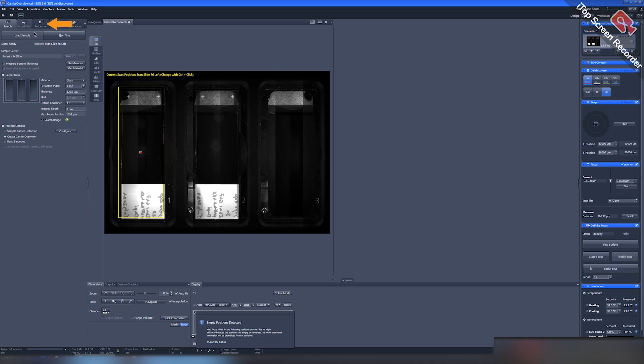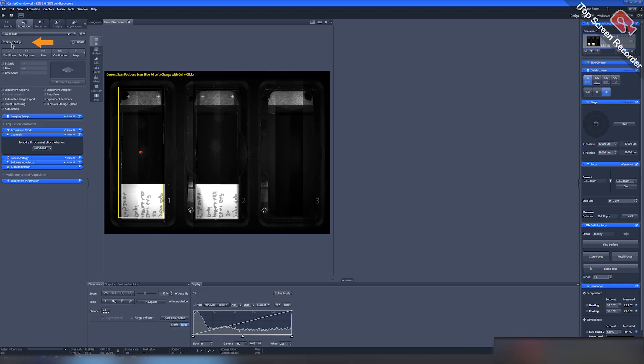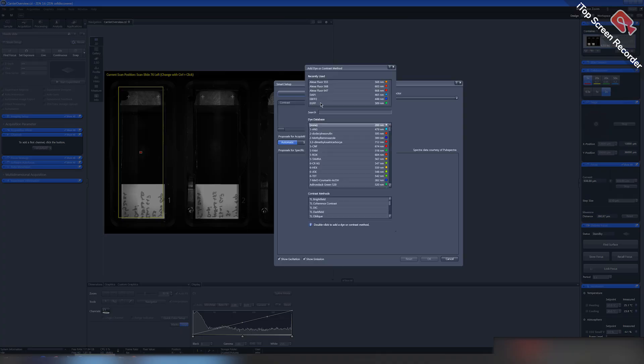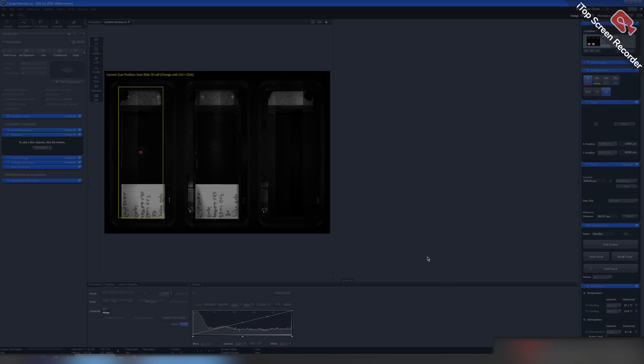Go to the Acquisition menu and press the Smart Setup button in the upper left corner of the workspace. In the window that appears, select the desired fluorograms and methods and press OK.